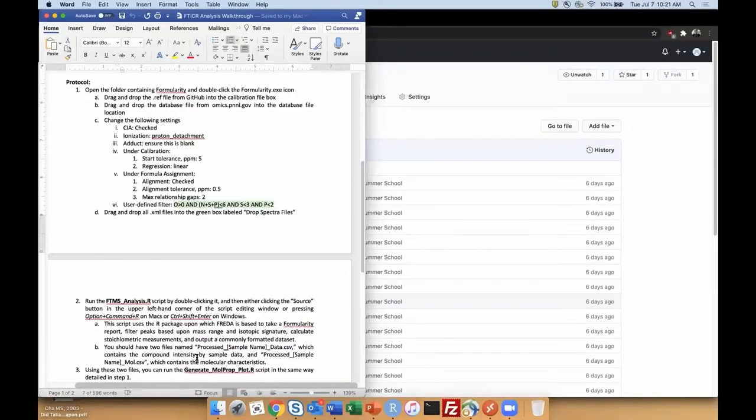Now again, I do want to add the stress. If you're having problems and you're only generating a .txt or a .log file, try using a subset of the data, primarily the Altamaha data. And that will help you climb over that bump a little bit.